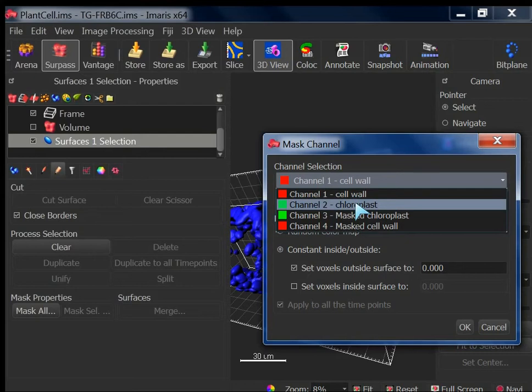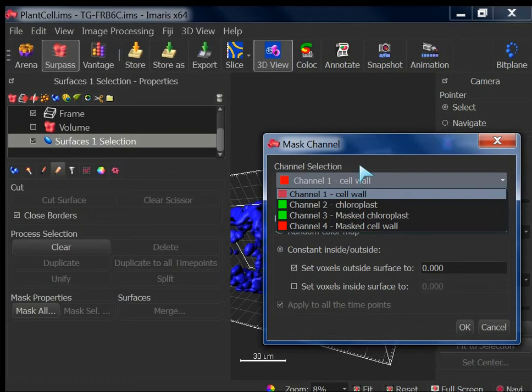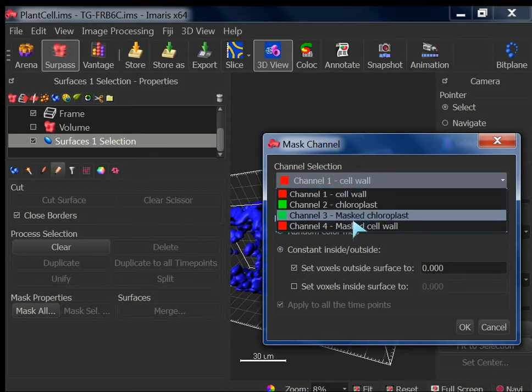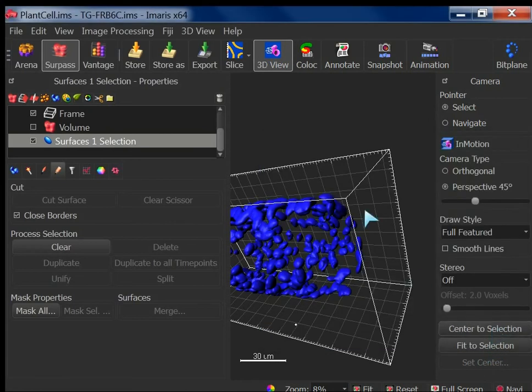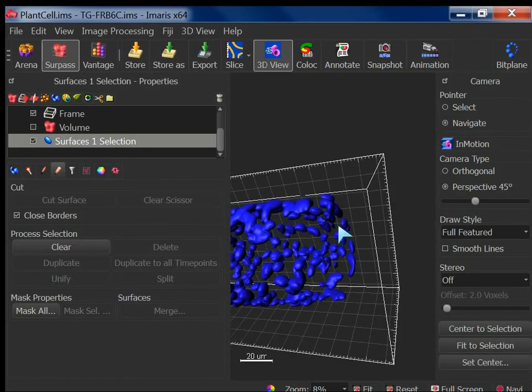But was that a question? No, that's not the original question. Oh, okay. So here now you have the modified data and the original data, but how did you manage to import the original data? He doesn't have the original here in mask. There is no original, I have deleted that. But how do you do that? Okay, that was the question. So how do I basically get the original one again and lay my mask over the original? Okay.